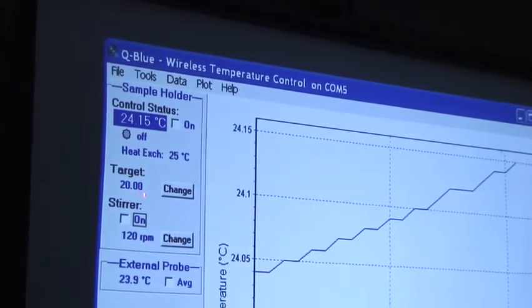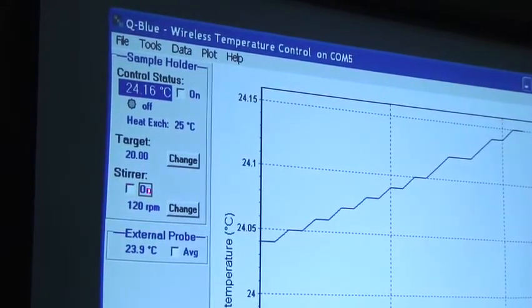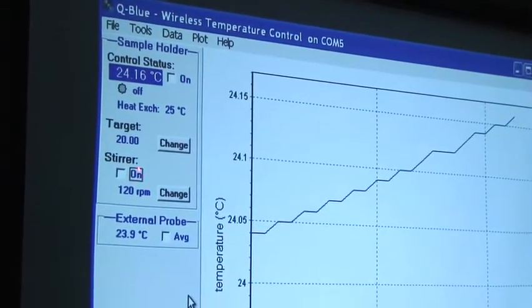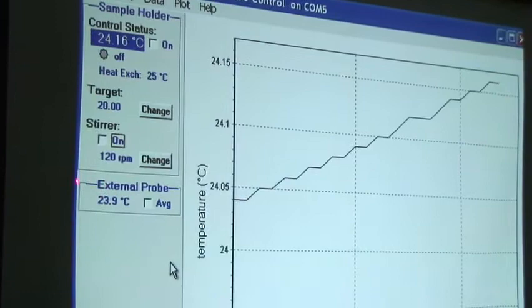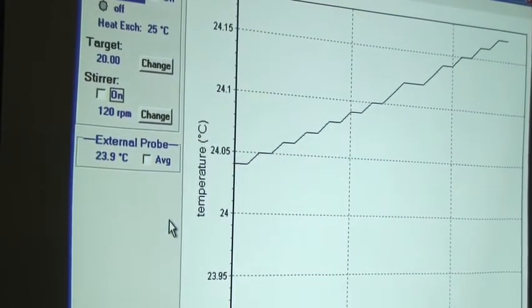There's a target temperature, and that's the temperature it's going to go to when you set it. You can turn the stirrer on and off. It found the external probe plugged in, and the room temperature is apparently 23.9 degrees.